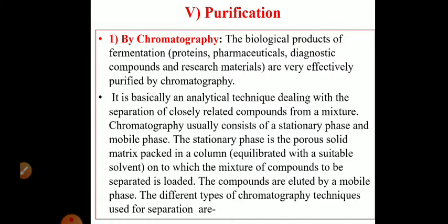Now, the biological products of fermentations like proteins, pharmaceuticals, diagnostic compounds, and research materials are generally effectively purified by the process of chromatography. What is chromatography? It's basically an analytical technique that deals with the separation of closely related compounds, or separation of components that are present in a mixture and the components are closely related.